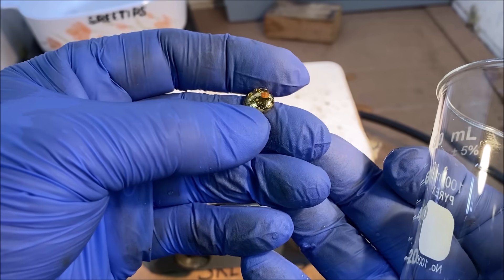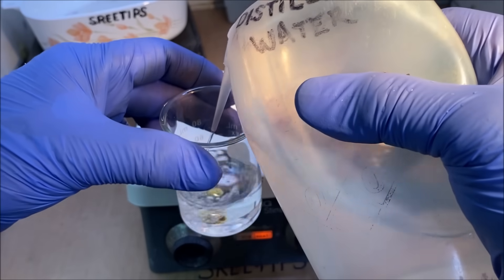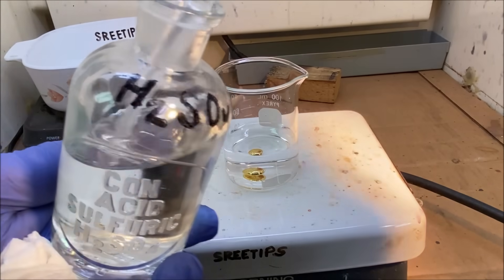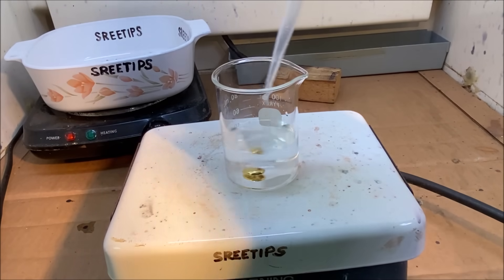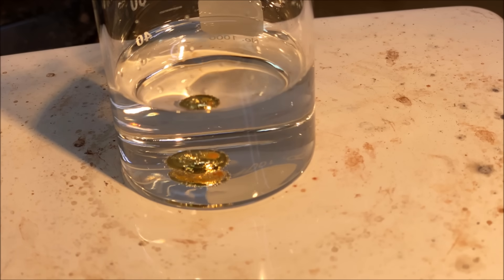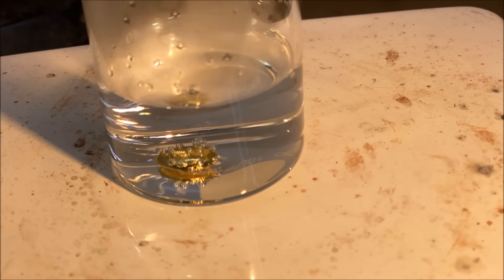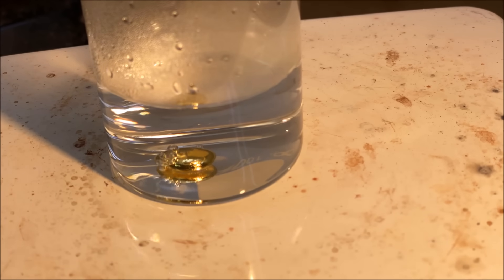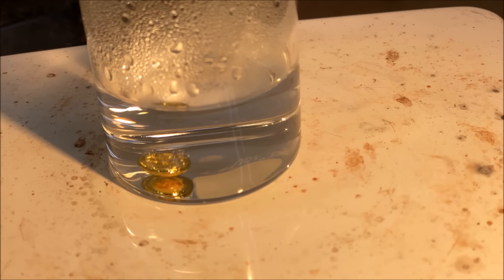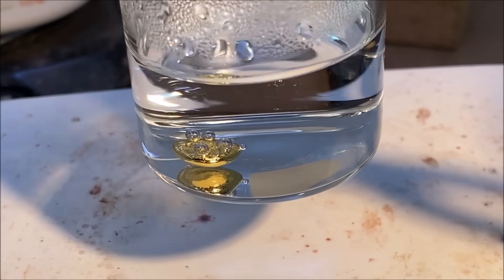It's got a little bit of flux on it. I'm going to put it in this beaker and add some distilled water. I'll add some sulfuric acid — this should dissolve off that flux very quickly. I've got all the flux dissolved off now. Let's go ahead and rinse this off and get a weight on our gold.